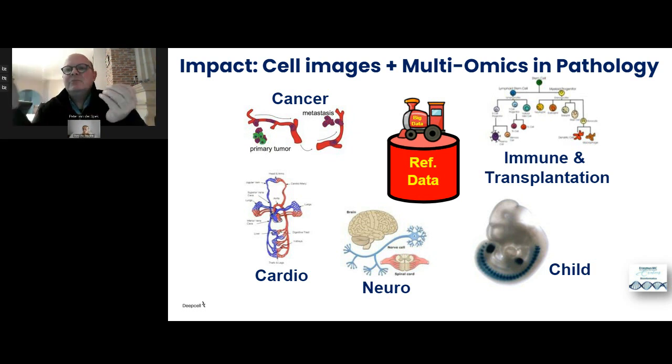Here we basically push the cells through, we separate and count them, and in a day we have a full picture of everything that's going on, where in the other experiments you are talking about a 3-day type experiment.